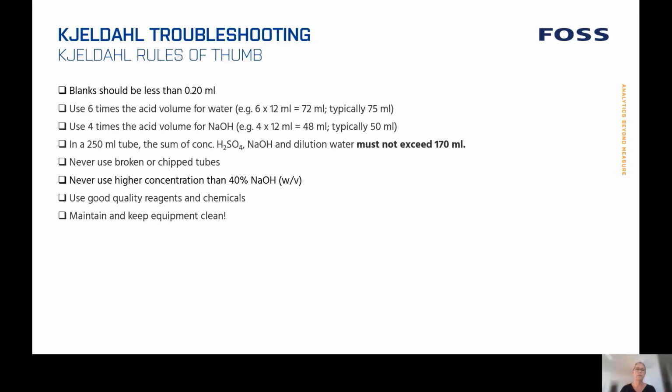You should, of course, never use broken or chipped tubes, and never use a higher concentration than 40% sodium hydroxide, and that is weight per volume. And you should, of course, always use good quality reagents and chemicals. And you should maintain and keep the equipment clean.